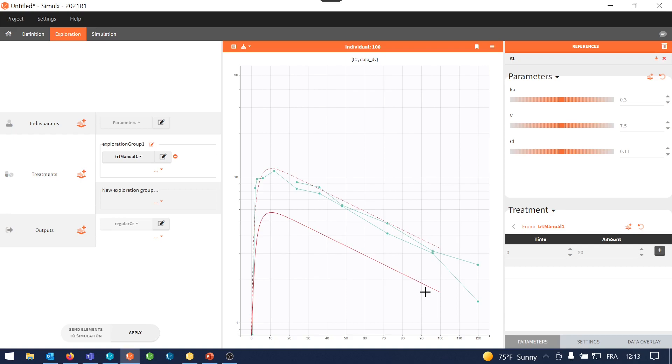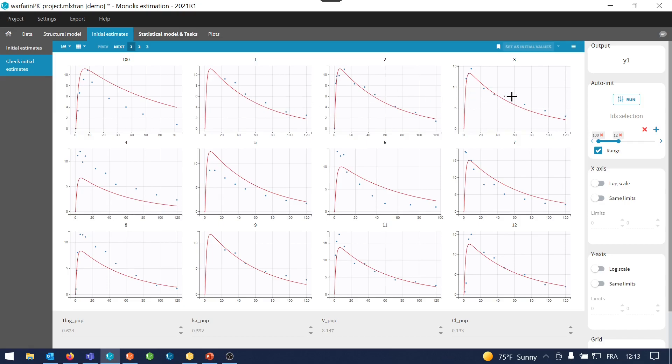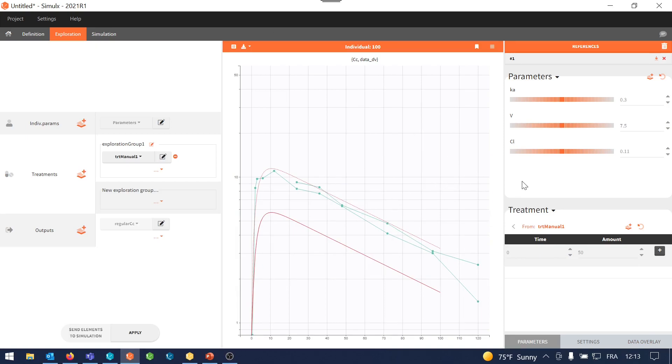So this exploration is similar to what we do in the Check Initial Estimates tab in Monolix. That is here. However, in Monolix, the dataset is fixed, including the treatments. And the goal is to pursue a population approach. Here in Simulix, you can explore models, parameters, data, treatments in a more modular manner. And this way, you can get a better feeling of the impact of each of those on your simulation.